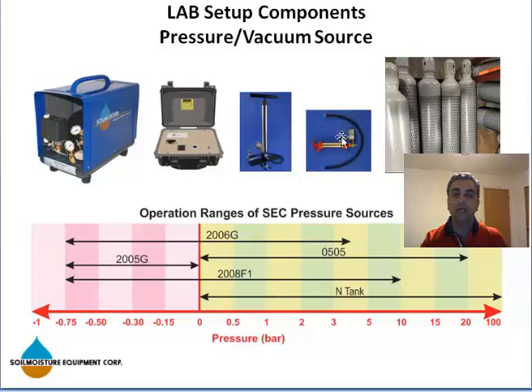Another source that you can always use for your lab setups is nitrogen tanks. Nitrogen tanks can be rented locally. We do not provide the tanks. We do not rent nitrogen tanks, but we can provide you with regulators that can be used in line with the nitrogen tank and to your pressure manifolds.